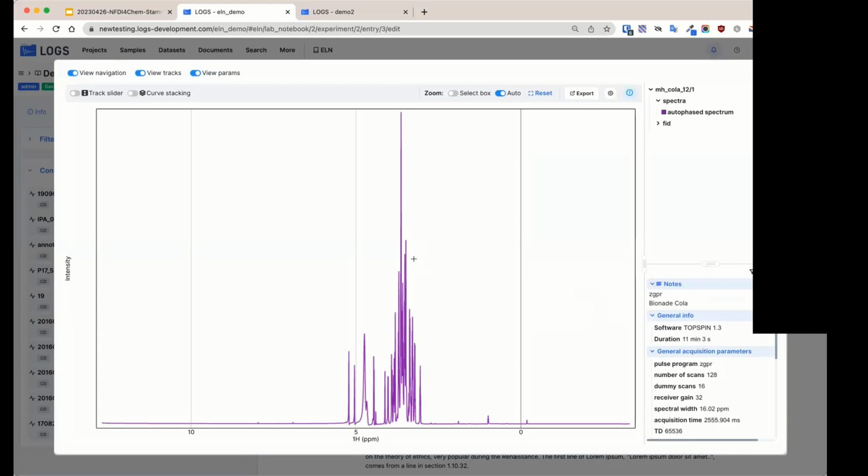And because the data was uploaded, you can also download the data, the primary data, or maybe even more information, and then really quickly jump from the manuscript to the actual data in question, right? So we've linked that up. We're quite happy with it.